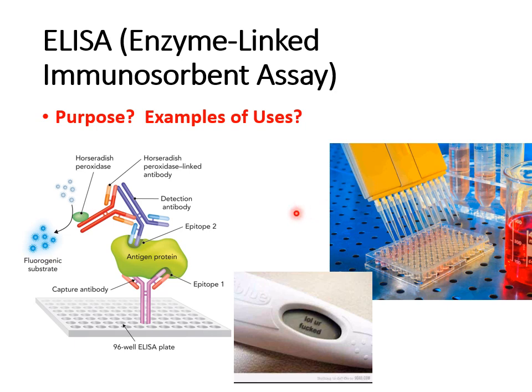And one other thing that I want to mention, I could talk for ages on ELISA, but for our purposes in biochem, we'll be brief. One other thing that I want to mention is, in addition to this being used in diagnostics, like some of the COVID tests that you may have taken, another very famous ELISA is for what I call the parasitic infection that you are stuck with for life, aka pregnancy. So, pregnancy tests are a form, an everyday form of ELISA.